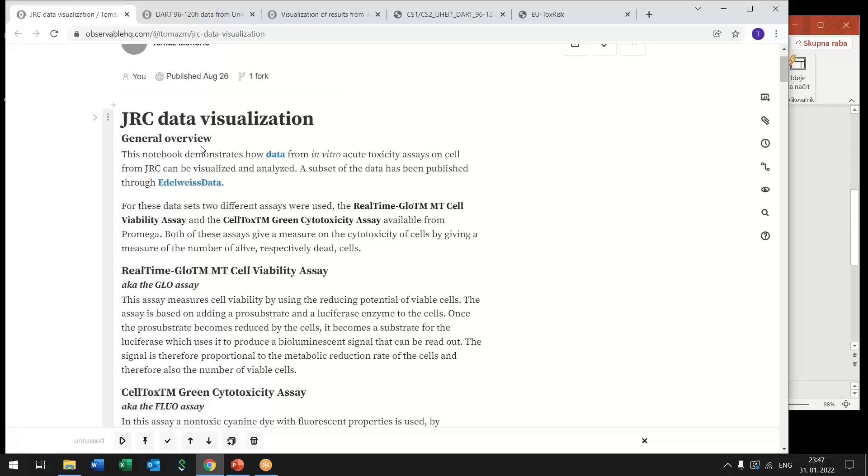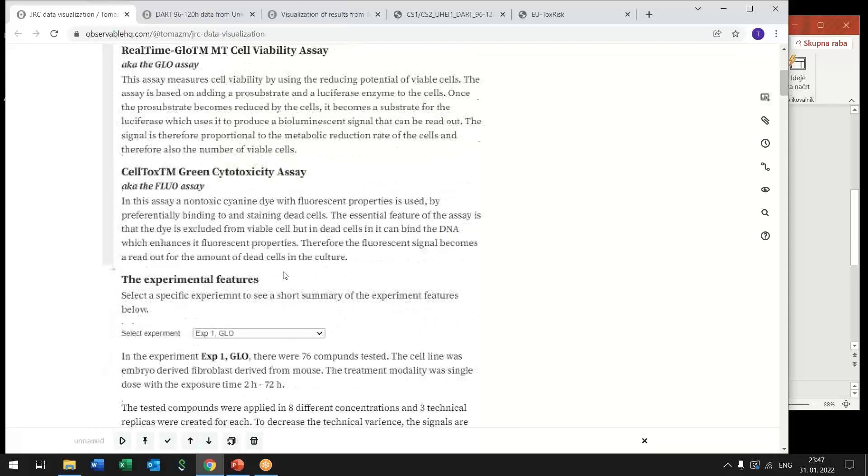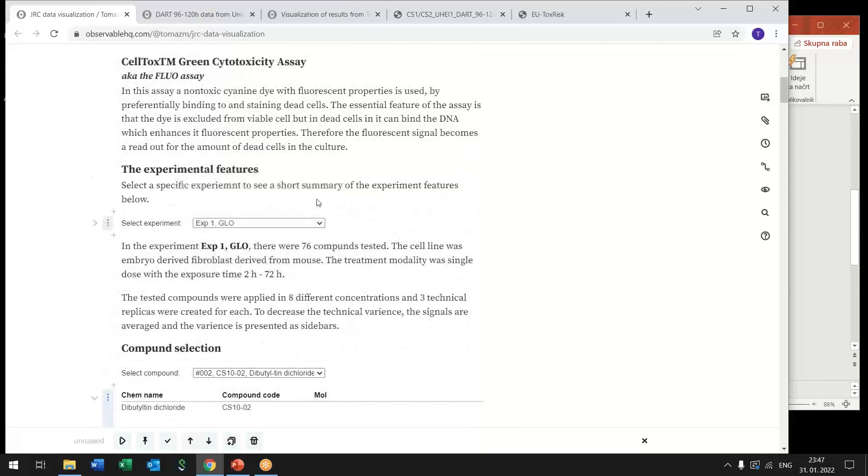So here this is the JRC data visualization notebook and we cover two assays that they were running on cell viability and cytotoxicity. And first we provide some short information about these assays and then the actual user interface starts.